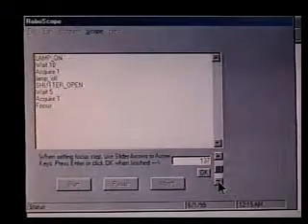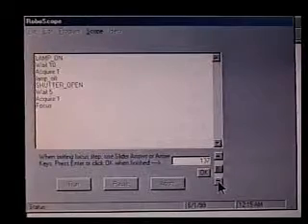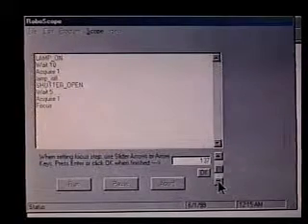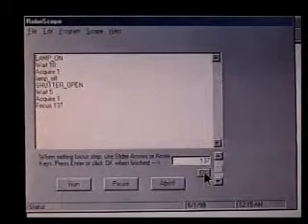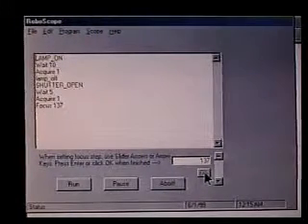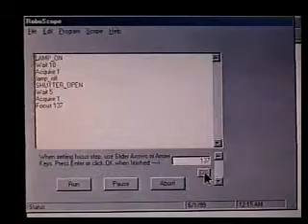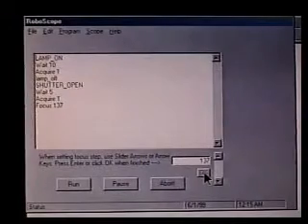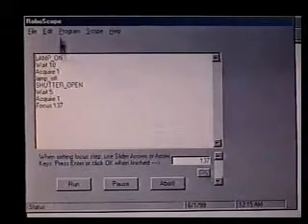Okay. Now, that's sort of an interesting different set of animals right there as I'm looking through the microscope. So, we'll choose that focal plane, and from there we will acquire an image.